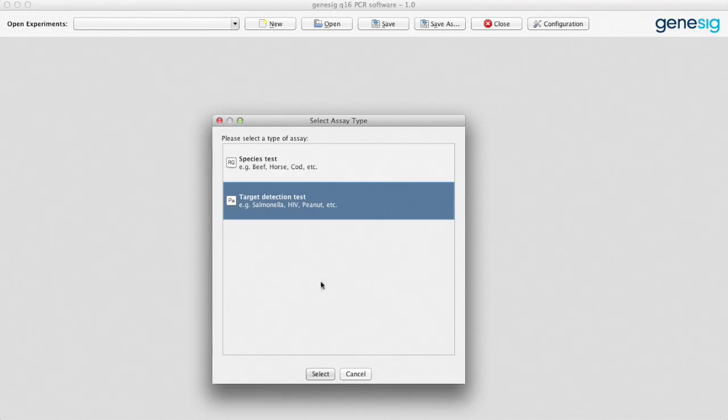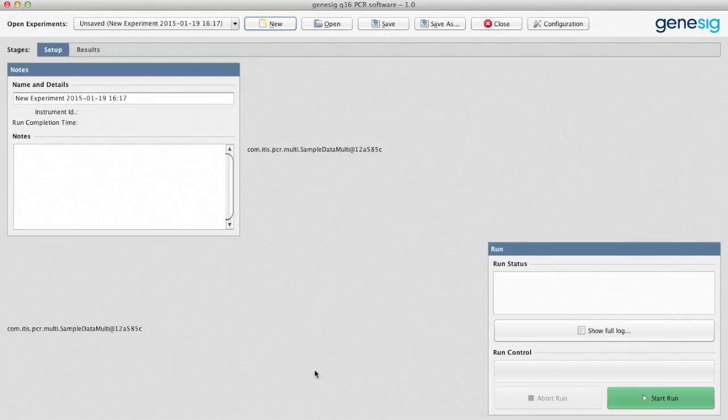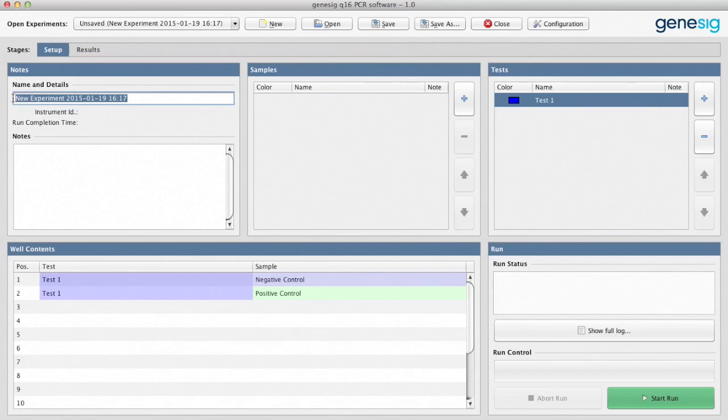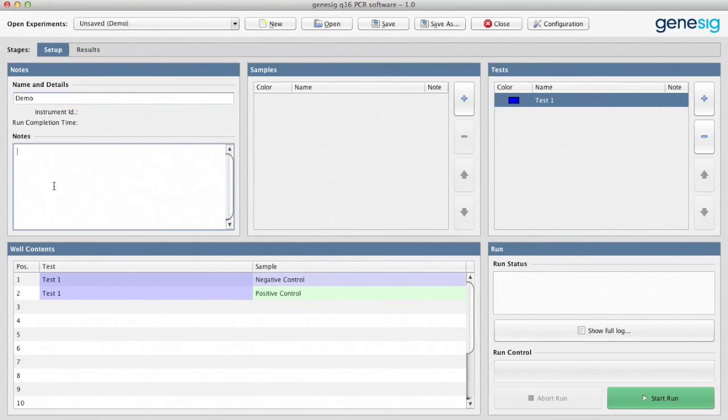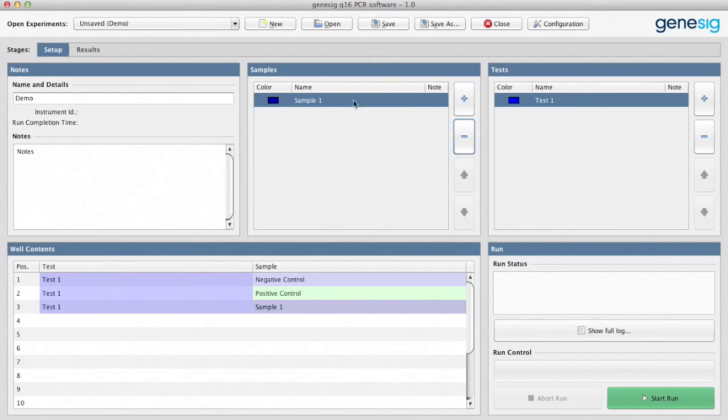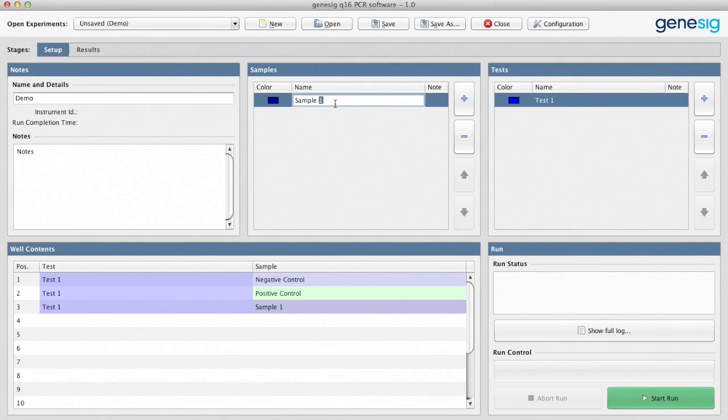On this occasion we're going to carry out a detection test for Listeria. You can name your experiment here and add notes here if you like. Here is where you define how many samples you're testing. In this case we're going to keep things as simple as possible and test just one sample.